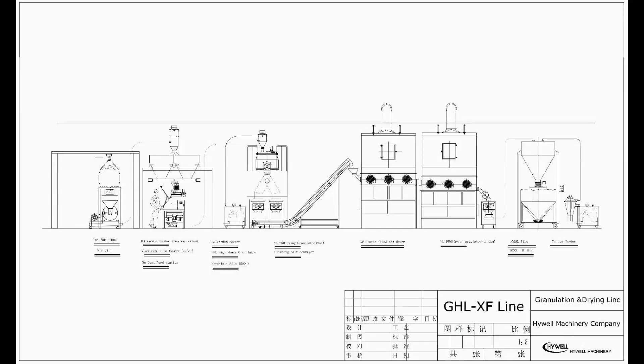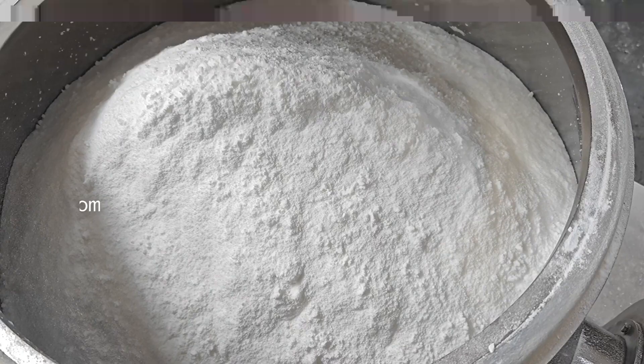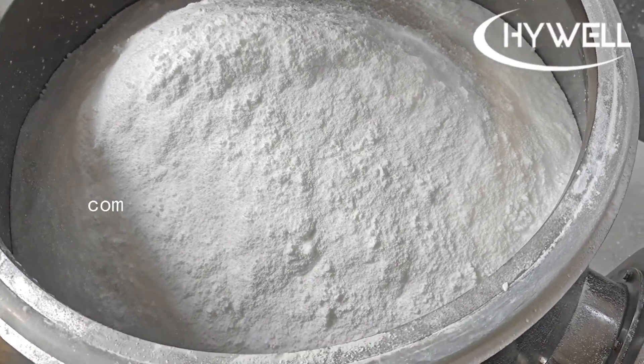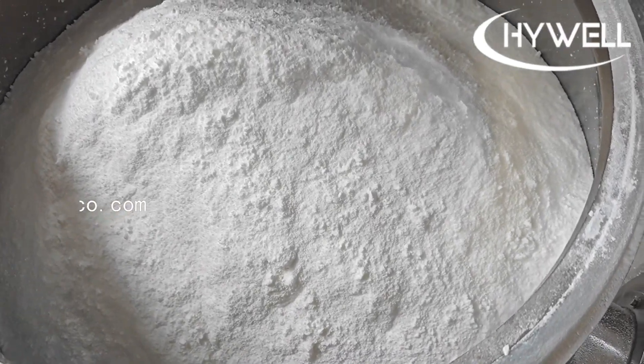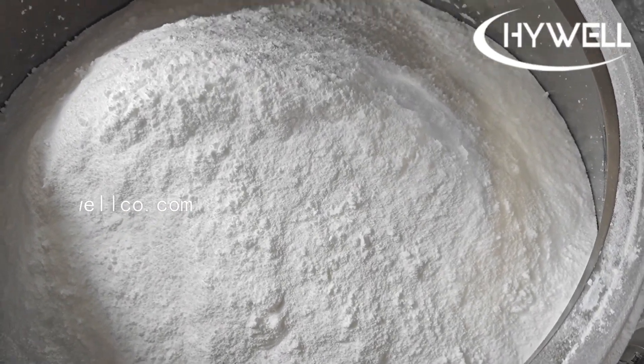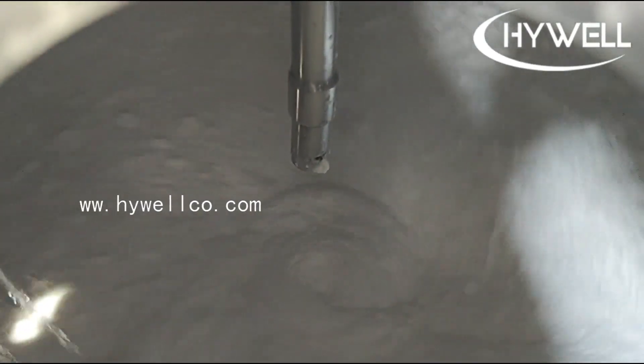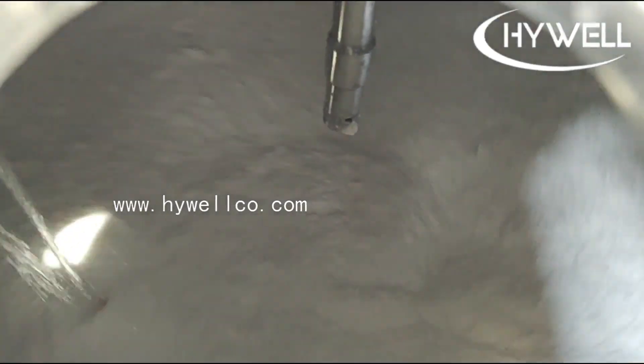This video shows the operation of a continuous wet instant granule production line, which is a test granulation machine in our factory. We test the materials according to the customer's process requirements to ensure that they meet the production needs.